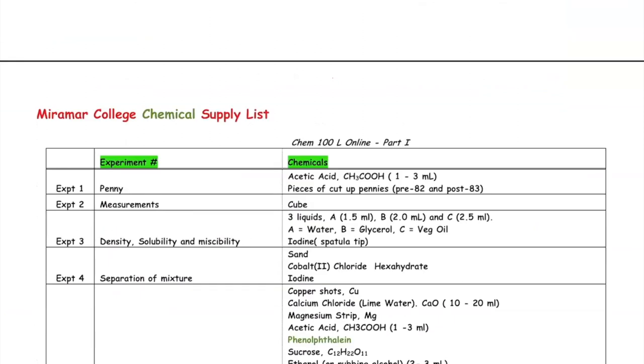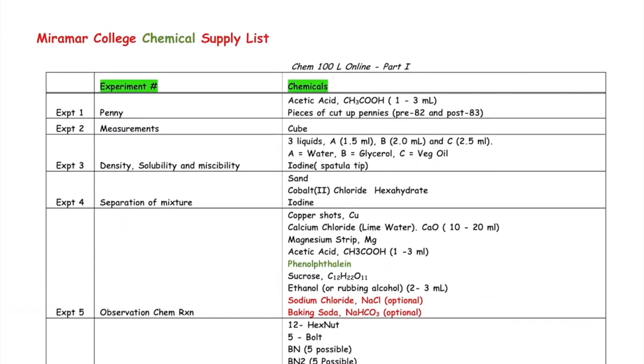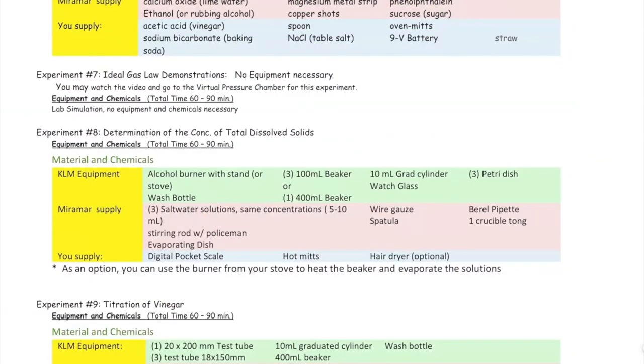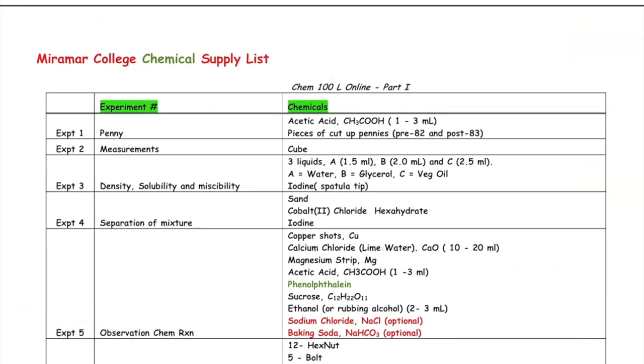Then these are the chemicals that you will need for each experiment. Okay, so what will happen when you pick up your kits tomorrow or Friday? It'll be in individual baggies. Experiment one will be in one baggie, experiment two will be in another baggie, experiment three will be in another baggie. You want to take each baggie, separate them out, and double check the inventory right here for the chemicals. Because if you're missing any of the chemicals, like we did last semester, they didn't have sodium hydroxide, so they couldn't do the experiment. So we have to improvise. Then you can't do the experiment if you don't have it. So these are the chemicals right here per experiment.